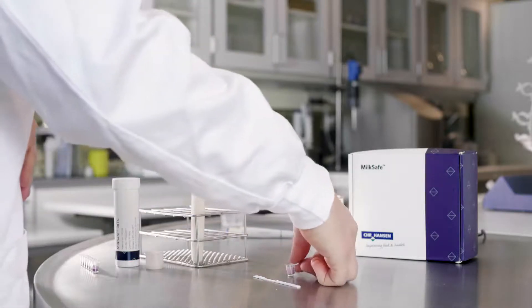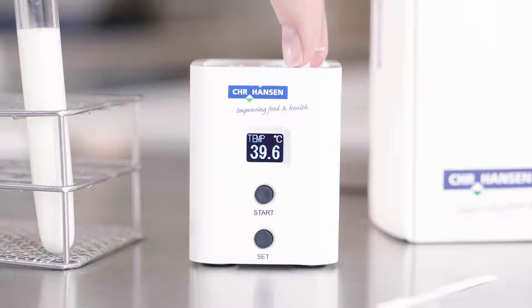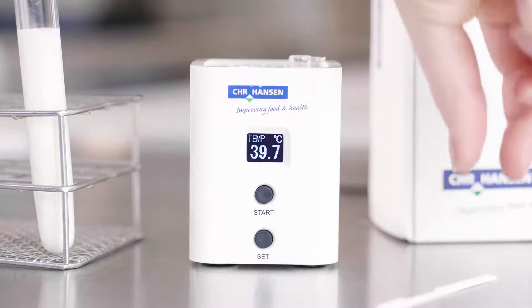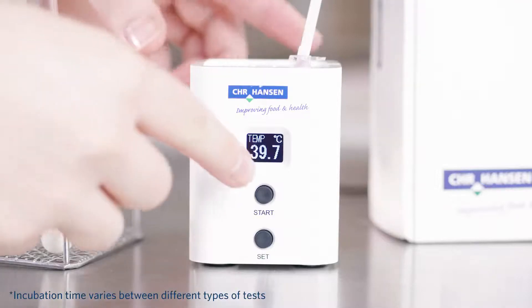Insert the reagent microwell into the incubator and insert the test strip. Incubate for 5 minutes.